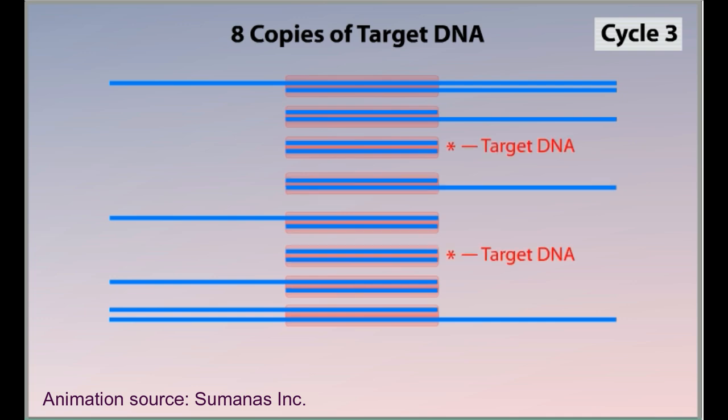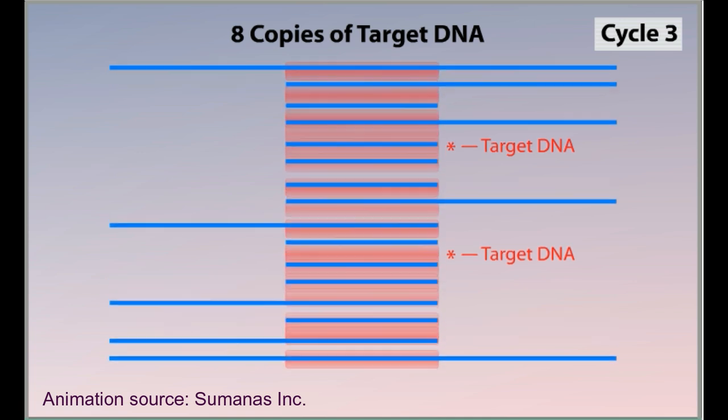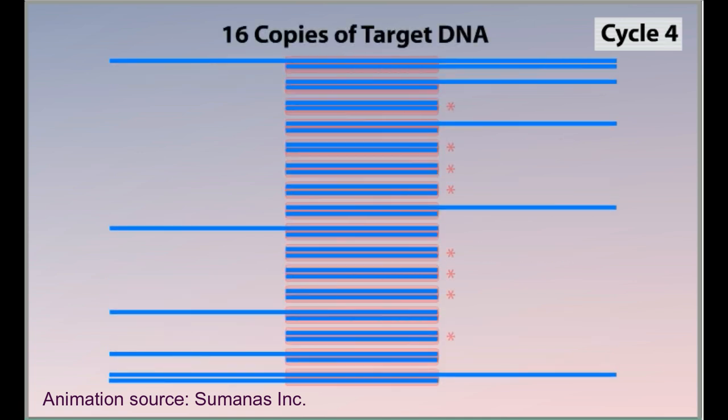As the number of cycles increases, the proportion of products consisting of just the target DNA increases. After 4 cycles, half of the fragments consist of just target DNA and half of the fragments also contain flanking DNA.